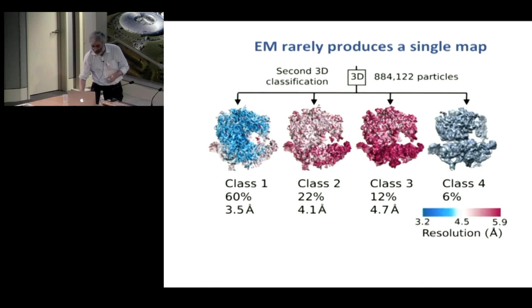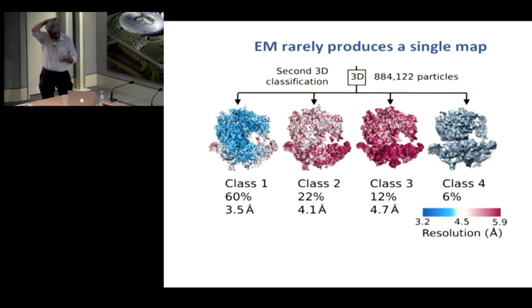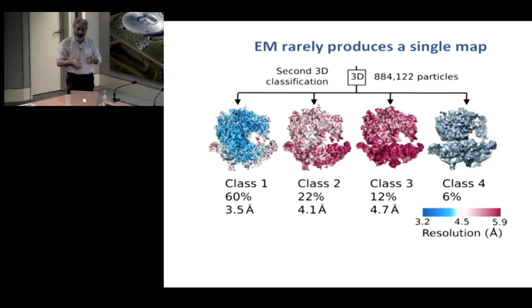It's very often, and one of the powers of cryo-EM in comparison with crystallography, is that in the same sample you may have different conformations. George may talk about that a bit later, but I'll just say that it is a good thing, as it can give us some information about the structure.